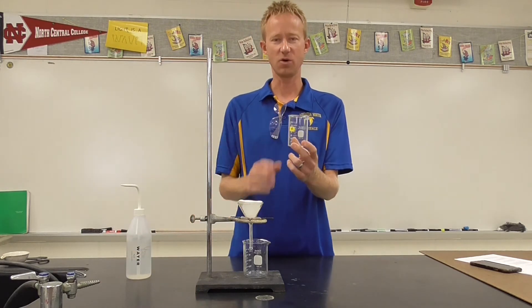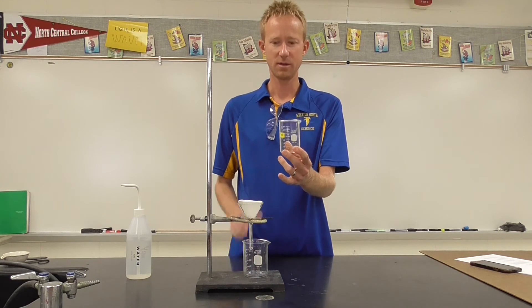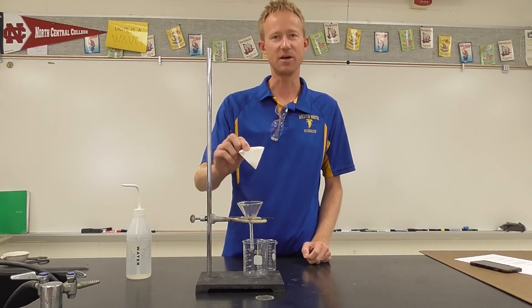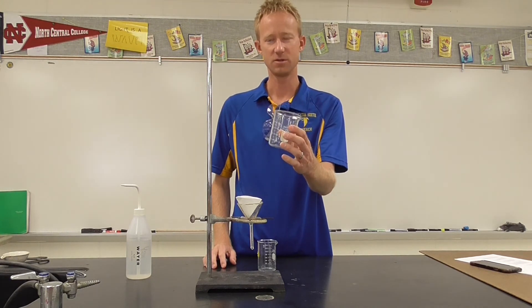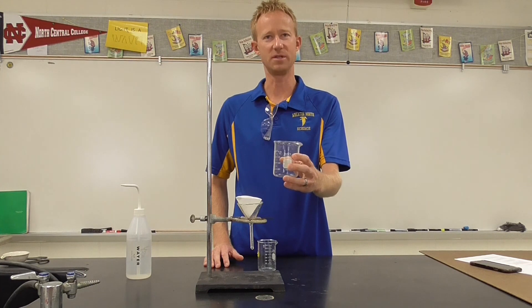Now once again, imagine in here we have a mixture with a liquid component and a solid component. As you pour this through the filter paper, the filter paper will catch the solid material and it will allow the liquid material — the filtrate — to be captured in the beaker. So this is a filtration setup, used to separate two components of a mixture.